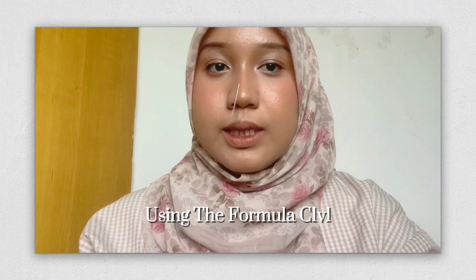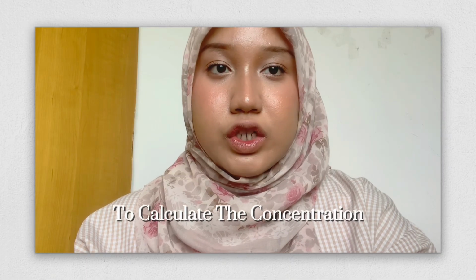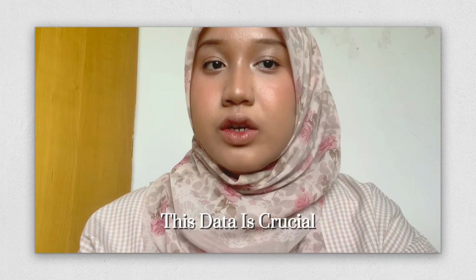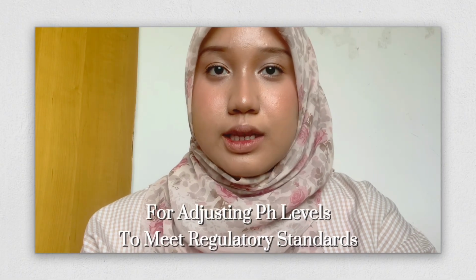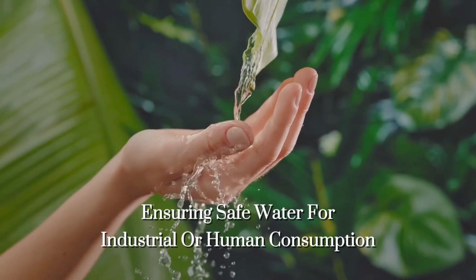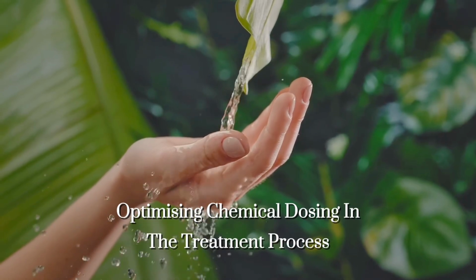Using the formula C1V1 = C2V2 to calculate the concentration of acid or base in the water sample. This data is crucial for adjusting pH levels to meet regulatory standards, ensuring safe water for industrial or human consumption, optimizing chemical dosing in the treatment process.